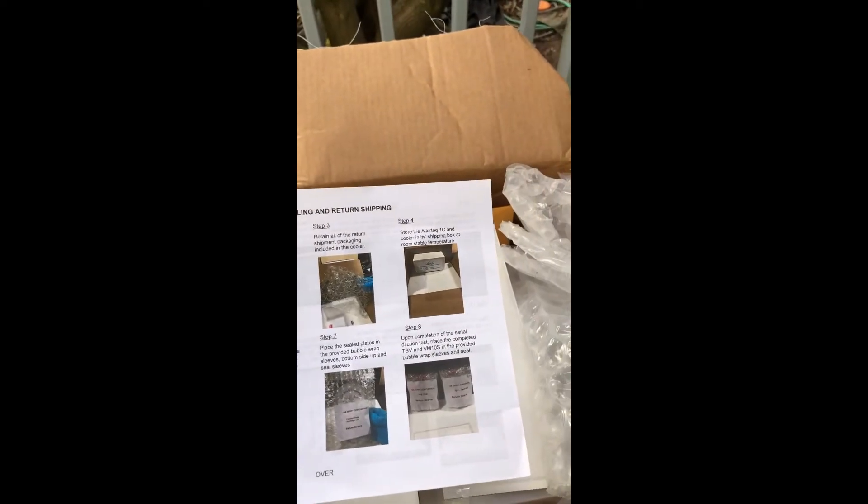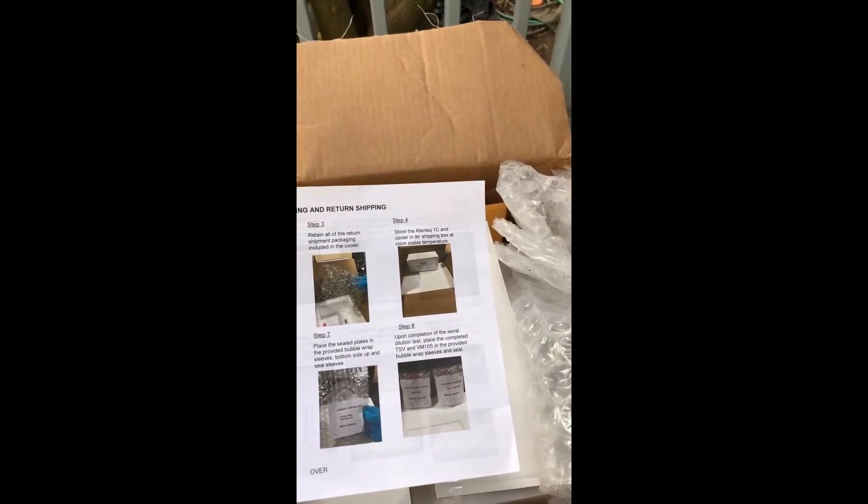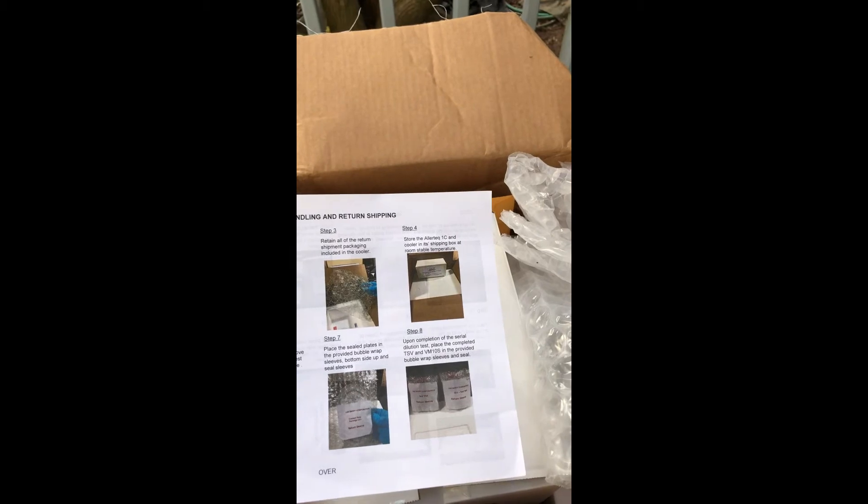Here's the same unpacking, handling, and shipping return, but not for warm weather conditions, where it shows you what each item is.